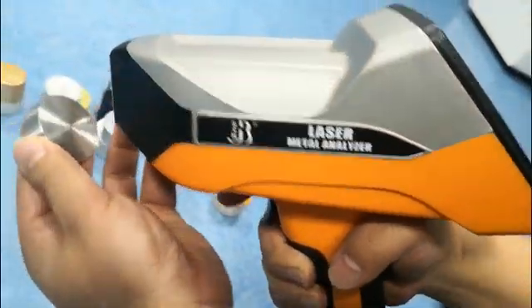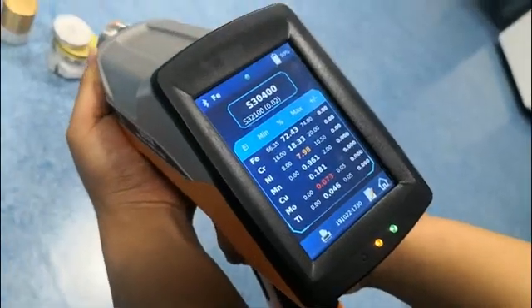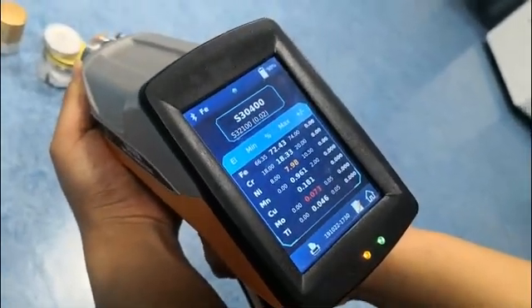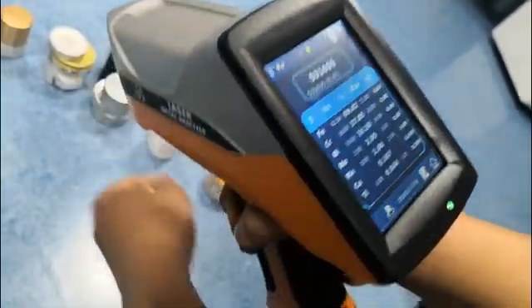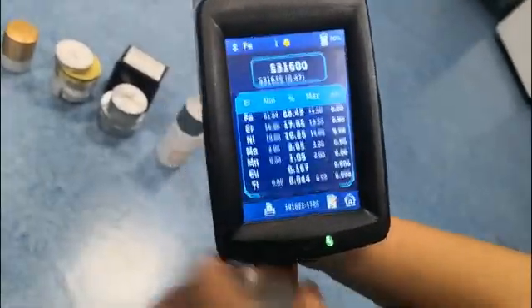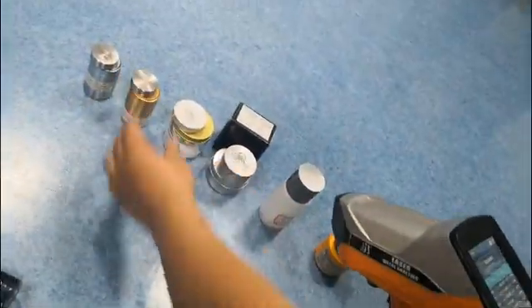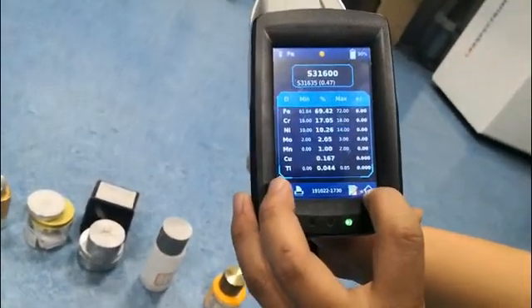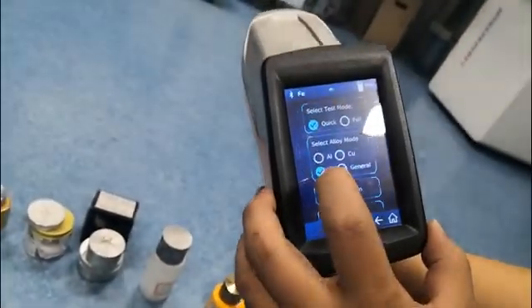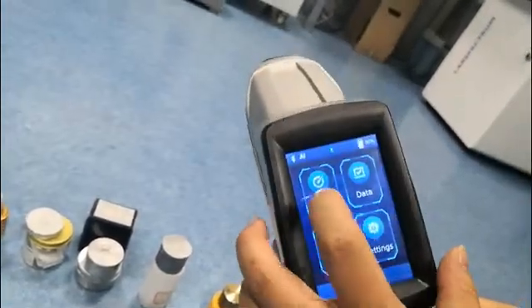Now we move to another sample — same, put it here. Okay, in one second the result is out: 316. Standard steel 316. Now we move to aluminum alloy base in quick mode test.